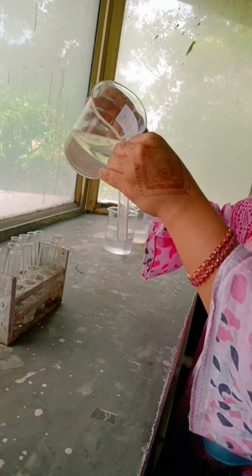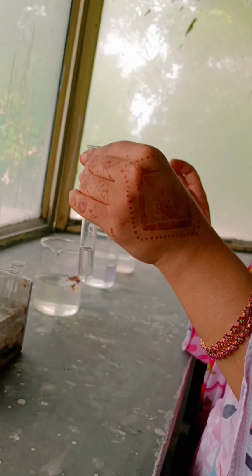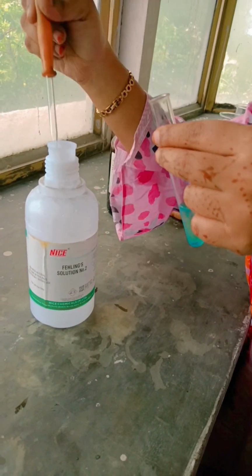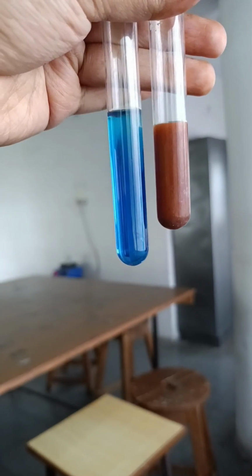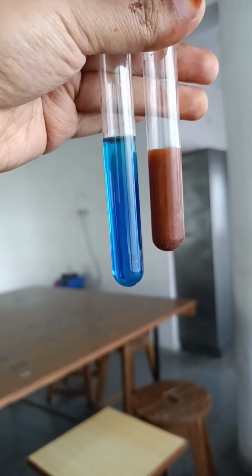Moving up with the next test, that is the Fehling's test. Again, take the sample and add Fehling's solution 1 and Fehling's solution 2 to the sample and keep it for boiling. And you can see here that a precipitate has formed, that is positive for Fehling's, and the blue one is negative for Fehling's, the positive and negative ones.